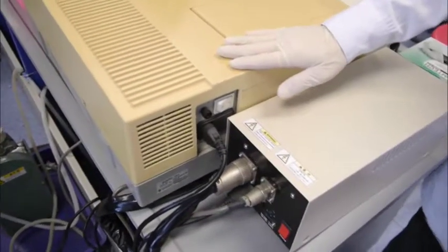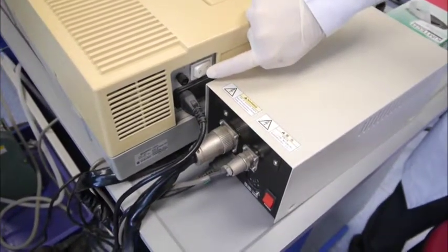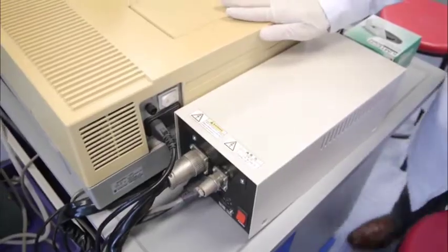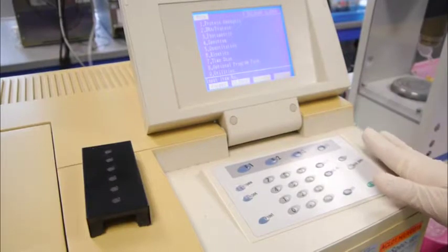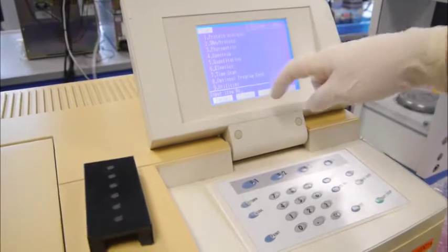Remember, at the beginning of the analysis, you will need to switch on the double-bin UV spectrophotometer as well as this controller before the analysis. After the instrument has been started, it will come to this main page where you can select the different modes of measurement.